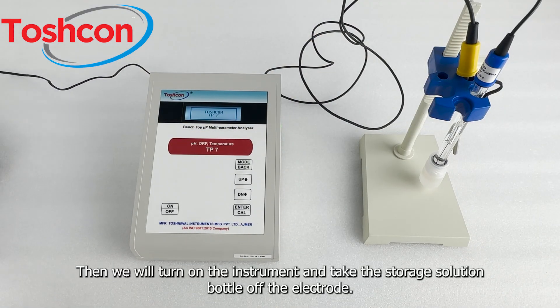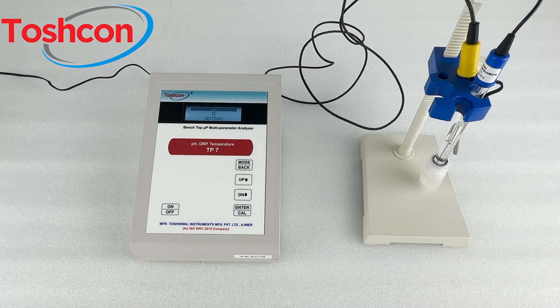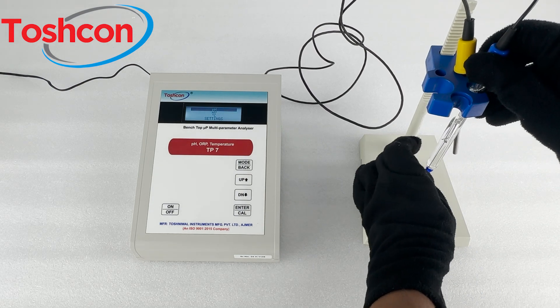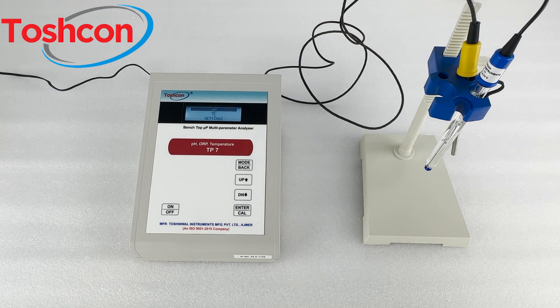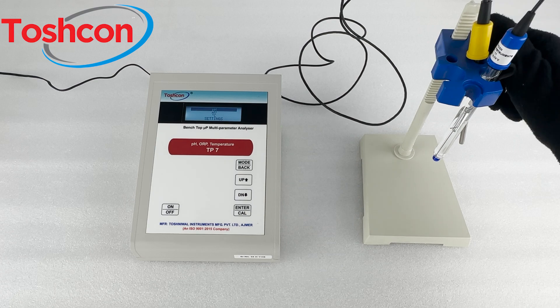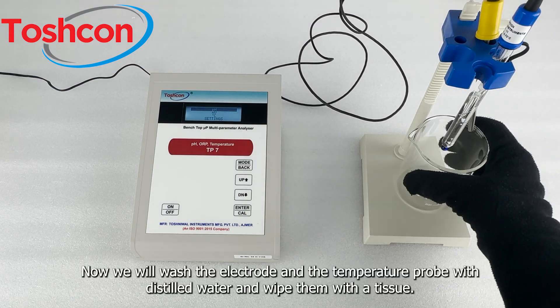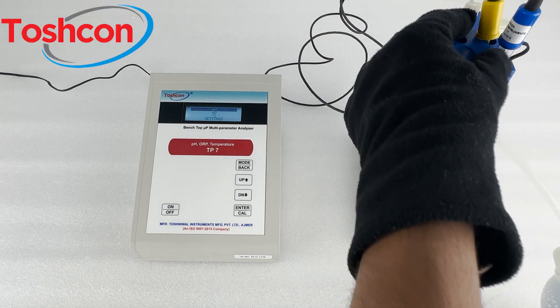Then we will turn on the instrument and take the storage solution bottle off the electrode. Now we will wash the electrode and the temperature probe with distilled water and wipe them with a tissue.